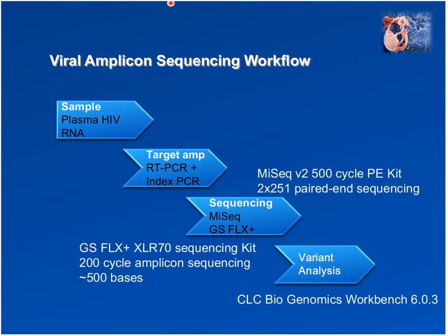Subsequent analysis of the data from these platforms was accomplished using the CLC Biogenomics Workbench version 6.0.3 at the time. So all data was compared using one analysis platform.